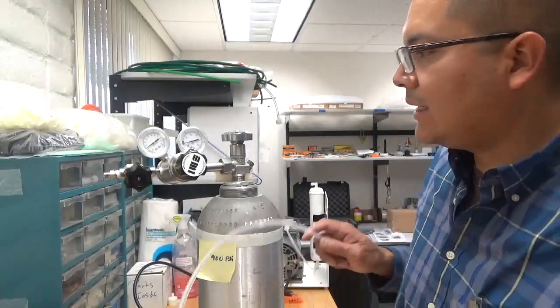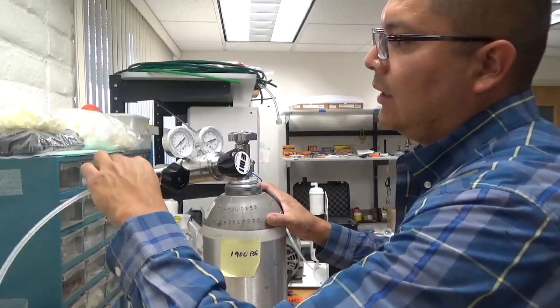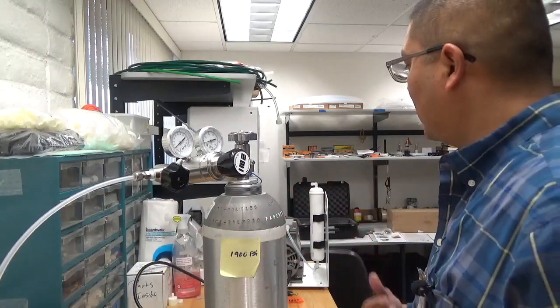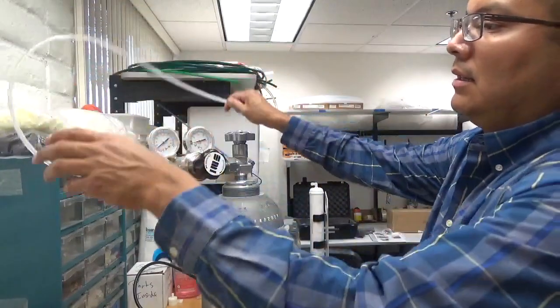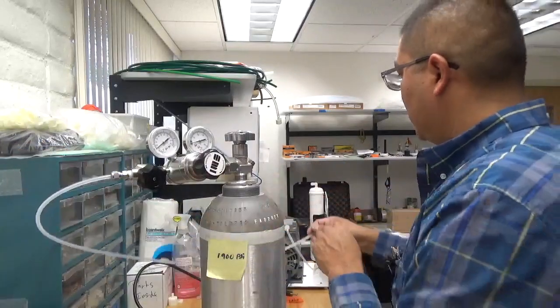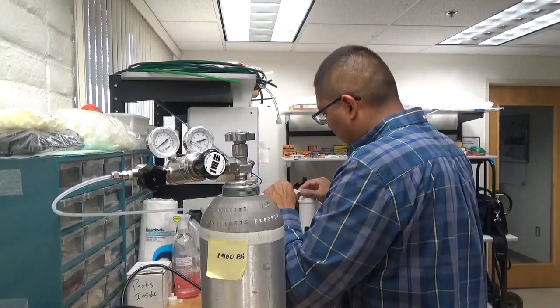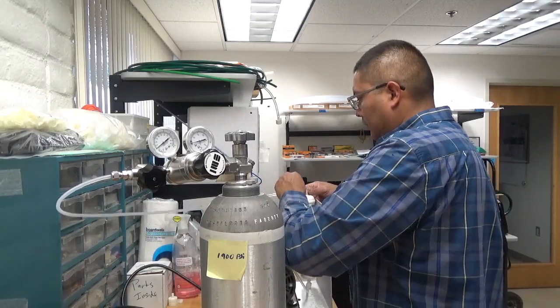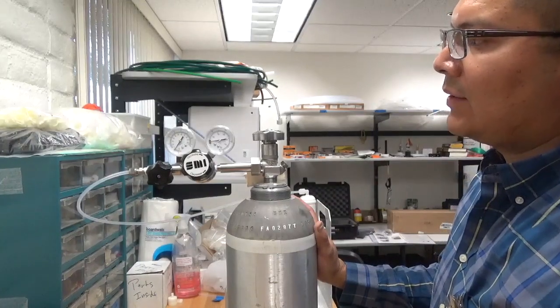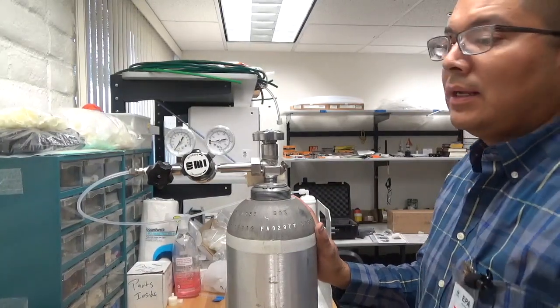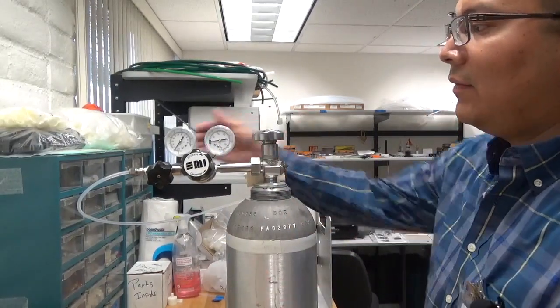Another thing I like to do is I like to attach the regulator valve to an external pump just to help draw out the air that might be stuck inside the valve itself. Now that we have the regulator valves connected, what we will do is we want to evacuate any air that's within the regulator valve. So what I did is I attached the regulator valve to an external pump.